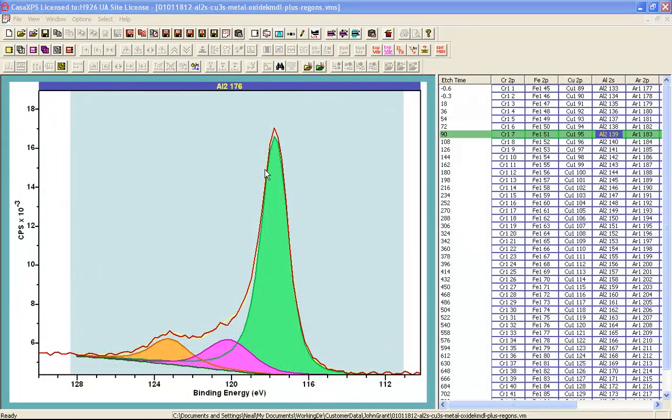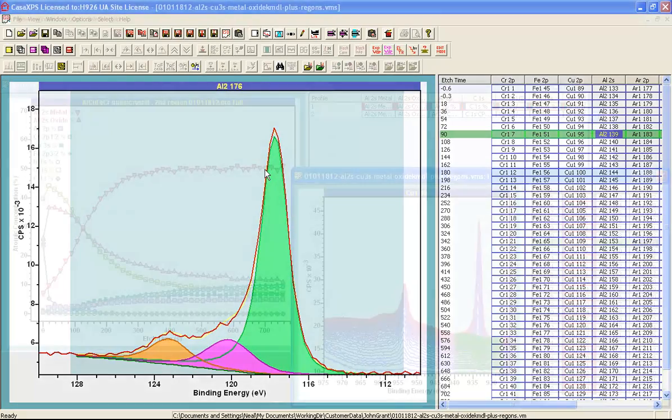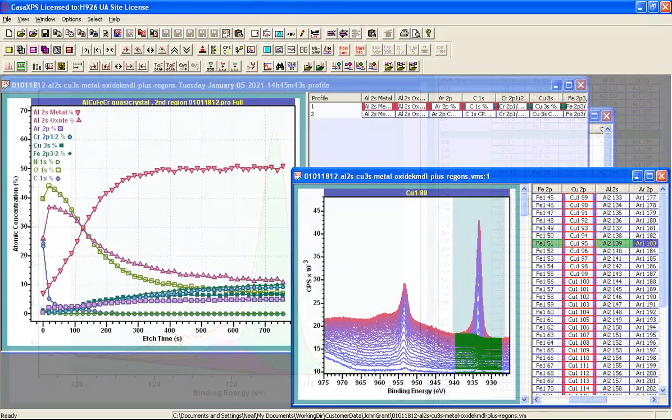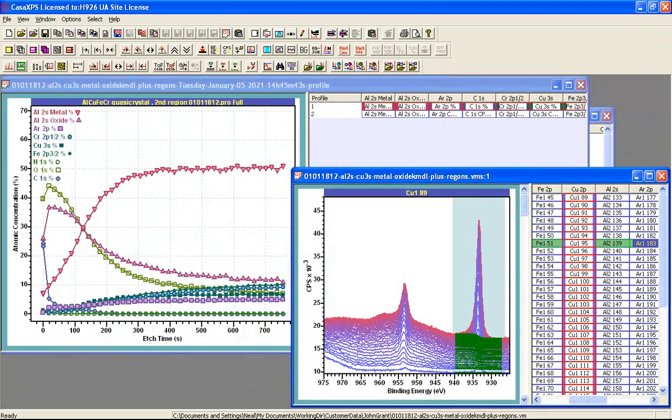A depth profile is therefore two different views into the same data file. You've either got spectra with regions and components or we have traces showing how a trend emerges with time.